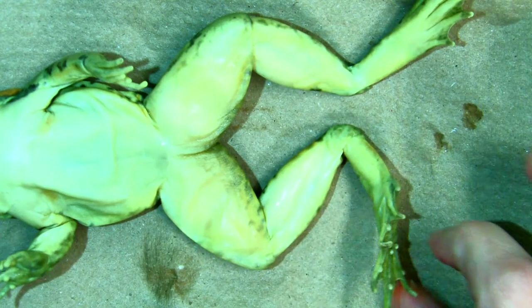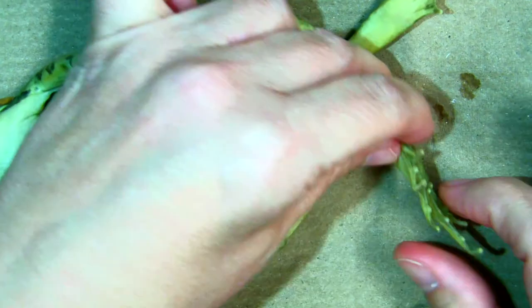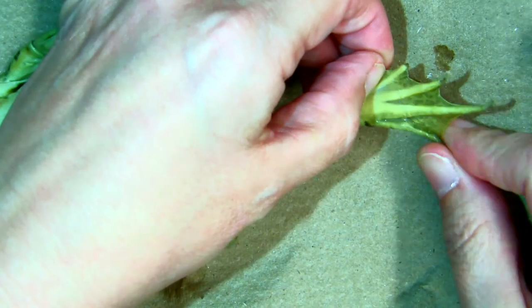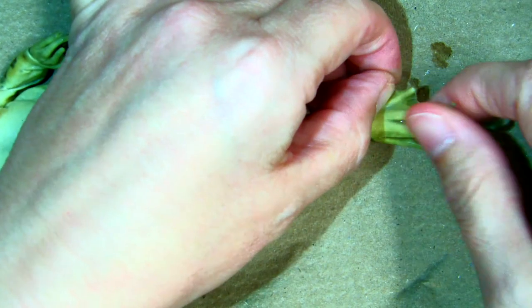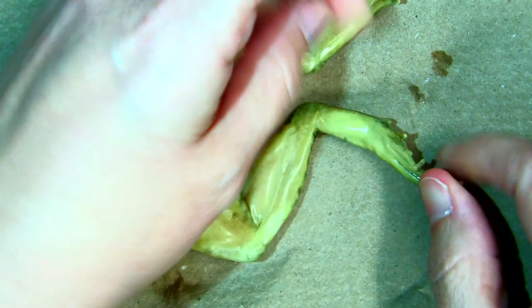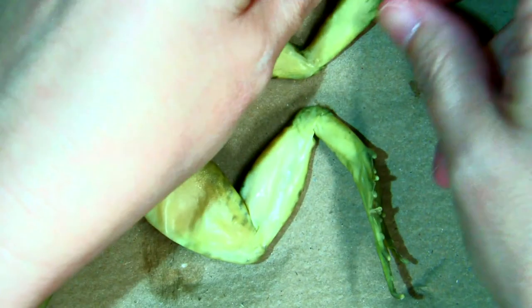On their feet, they have five digits with a web membrane in between, which helps them swim through the water.